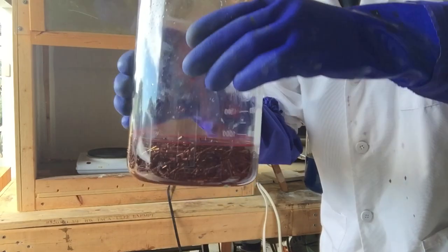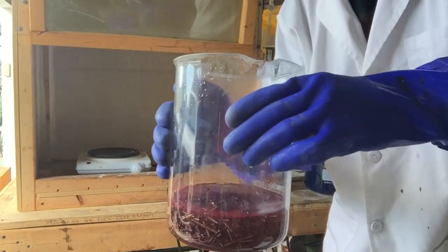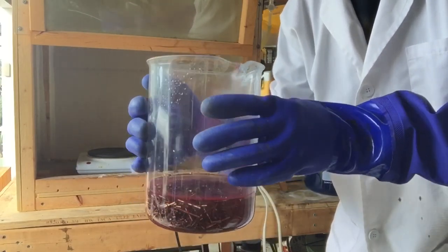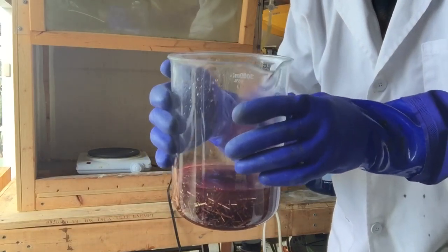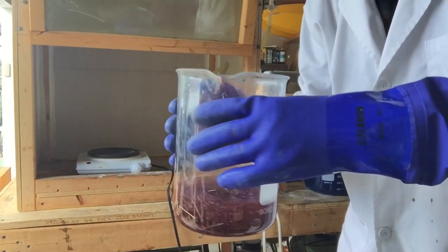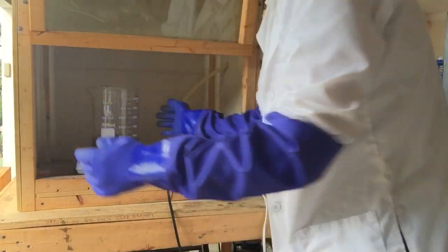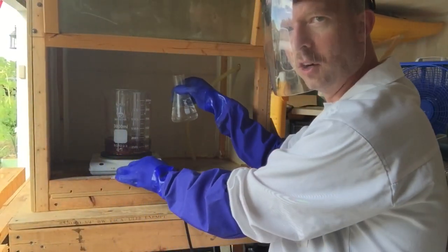I'm starting to get a weird red color in there. A lot of times when iron goes into solution it'll turn red, however none of these pins were magnetic at all, so I'm not 100% sure what's going on with that color. Either way we're going to continue — going to go ahead and put it back up on the heat and hit it with another nitric acid treatment.